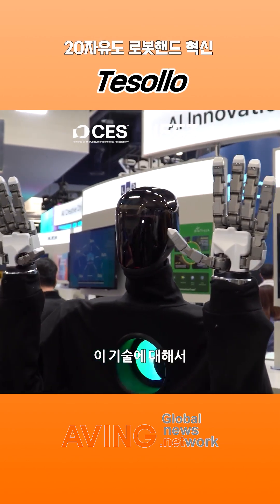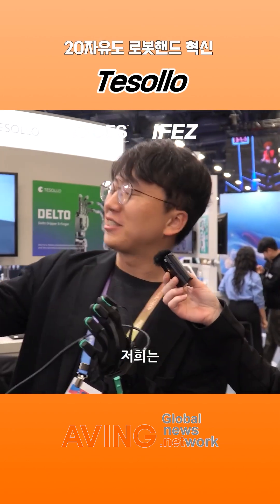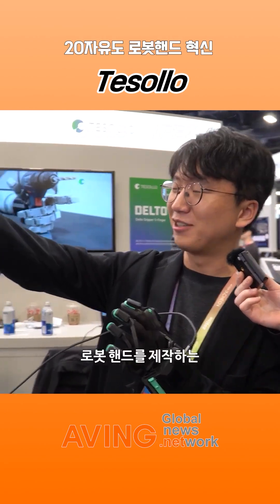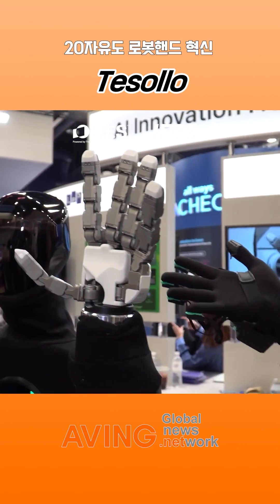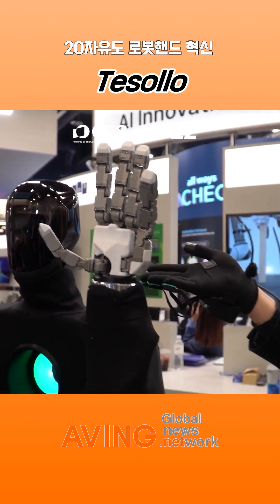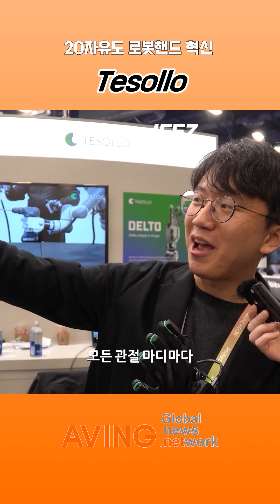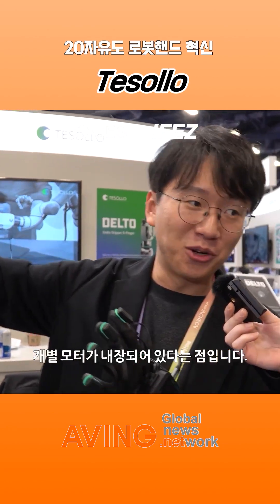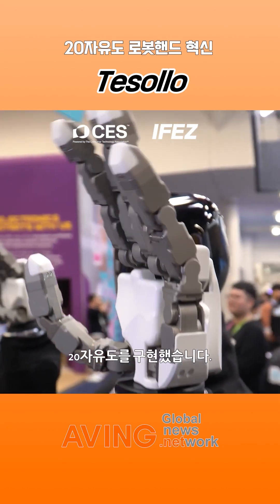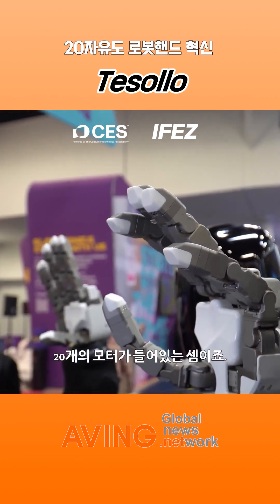Okay, so you have to tell us all about this technology. Our company is making this robotic hand from South Korea. And our main product, DG5F, is the humanoid hand. Every joint has an HG motor inside, so it totally has 20 degrees of freedom — 20 motors inside this small hand.